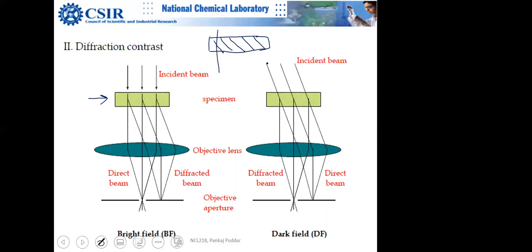So these mirrors will reflect the beam in some direction, right? The mirror can be in any direction. That's why Bragg used this term reflection. We know that it's not reflection, it's diffraction, but for the sake of understanding, you can consider that there is some kind of a mirror. So these are your Bragg diffracted electrons at angle theta. You know that the equation is lambda equals 2d sine theta, right?